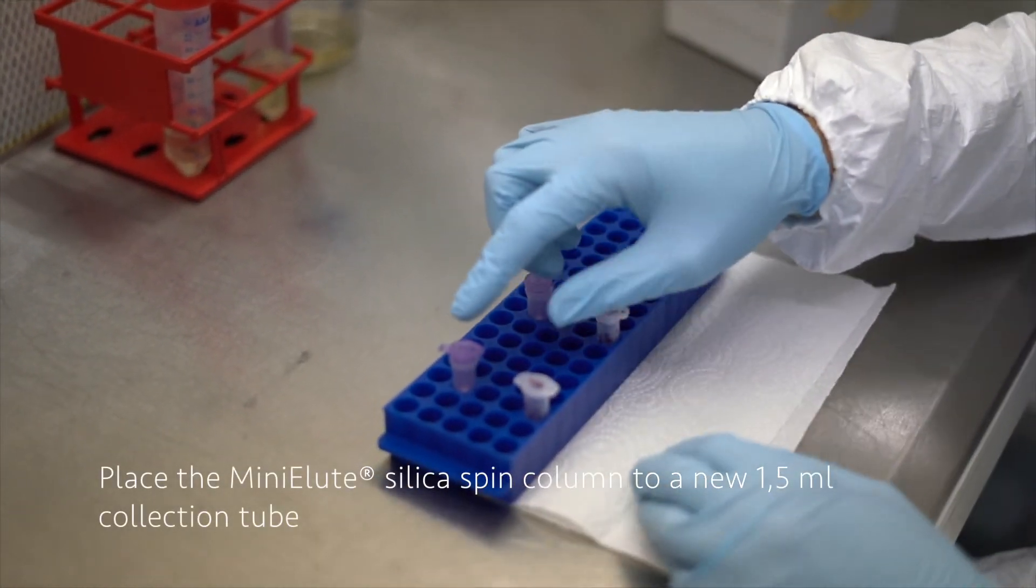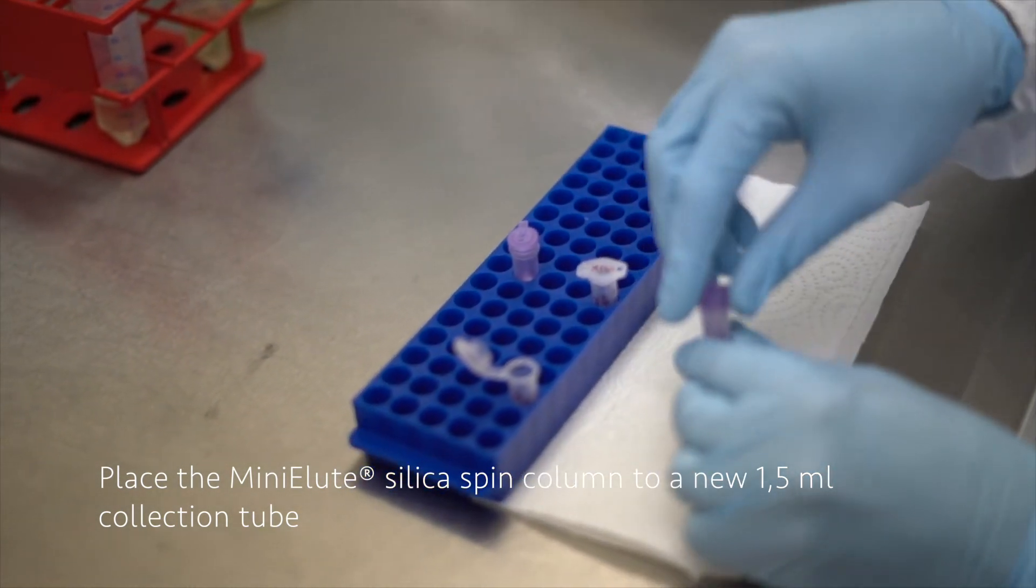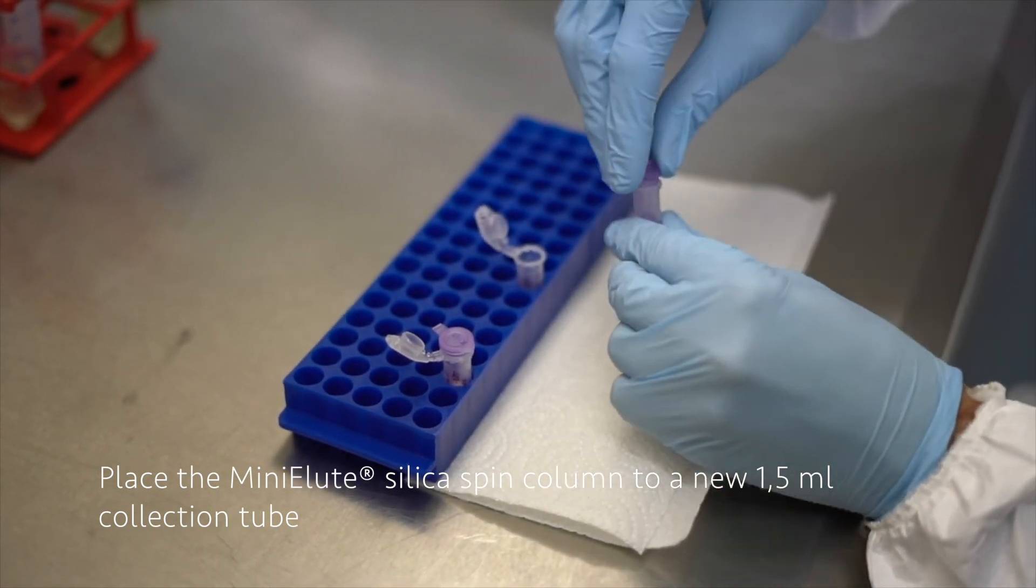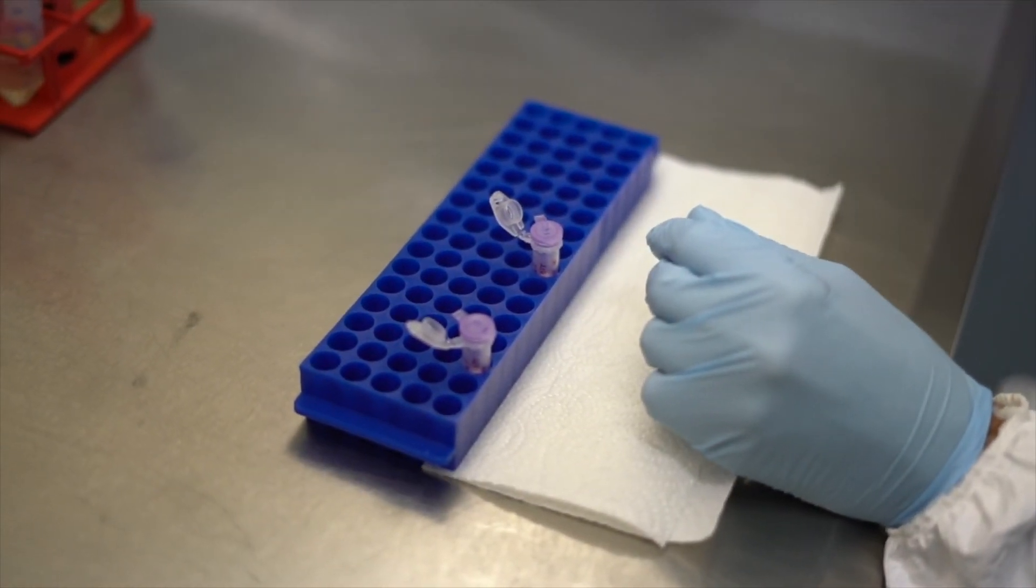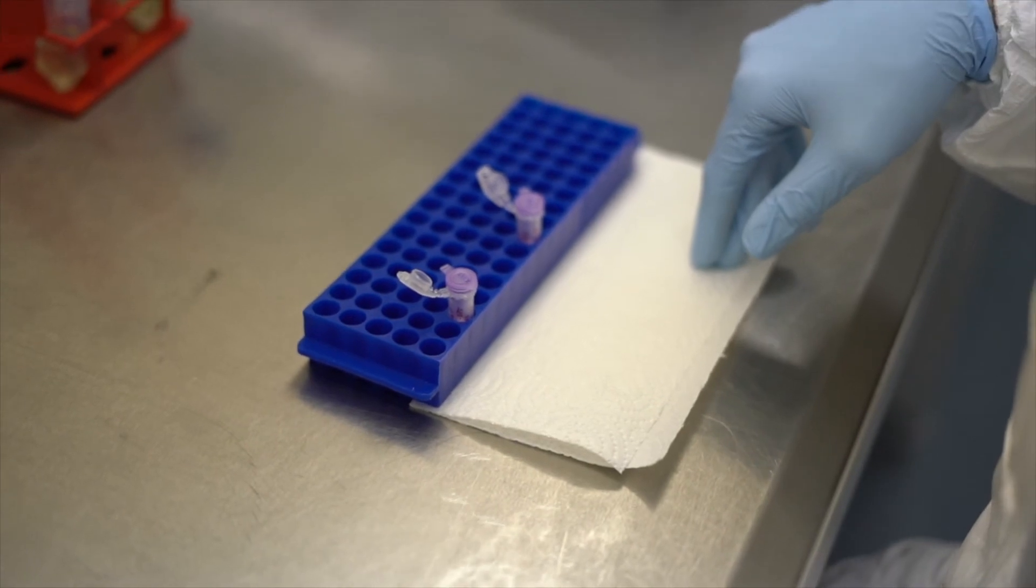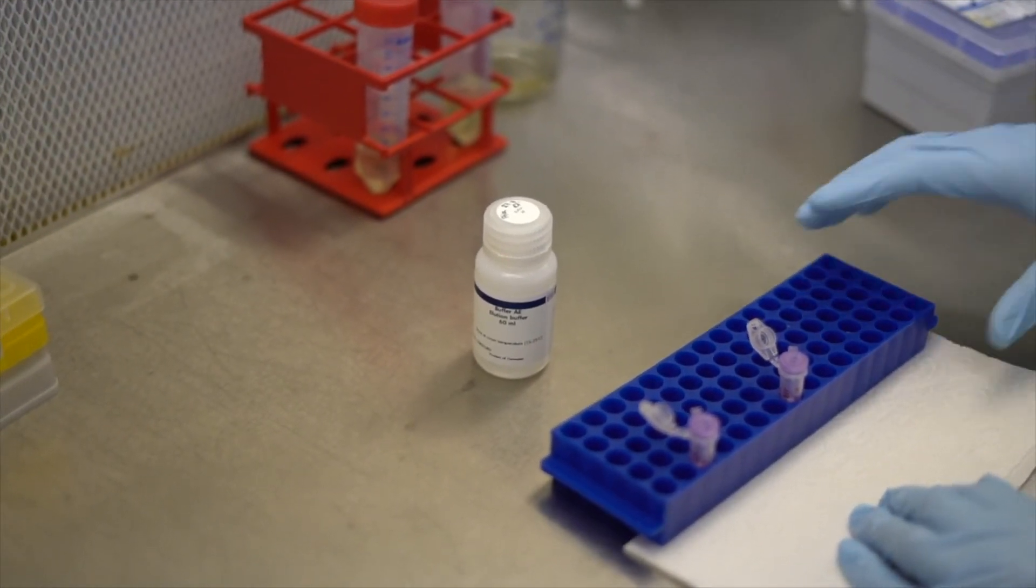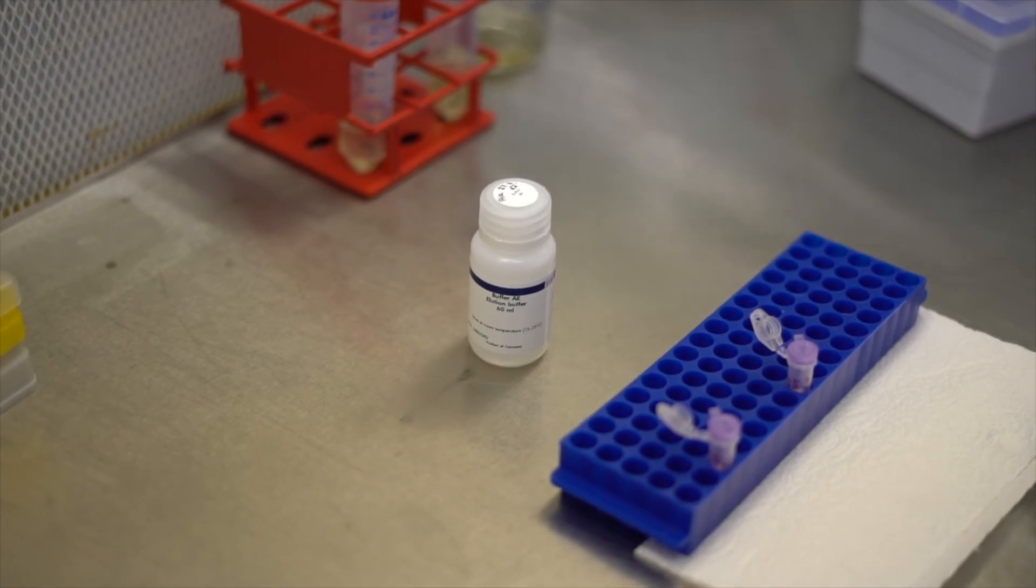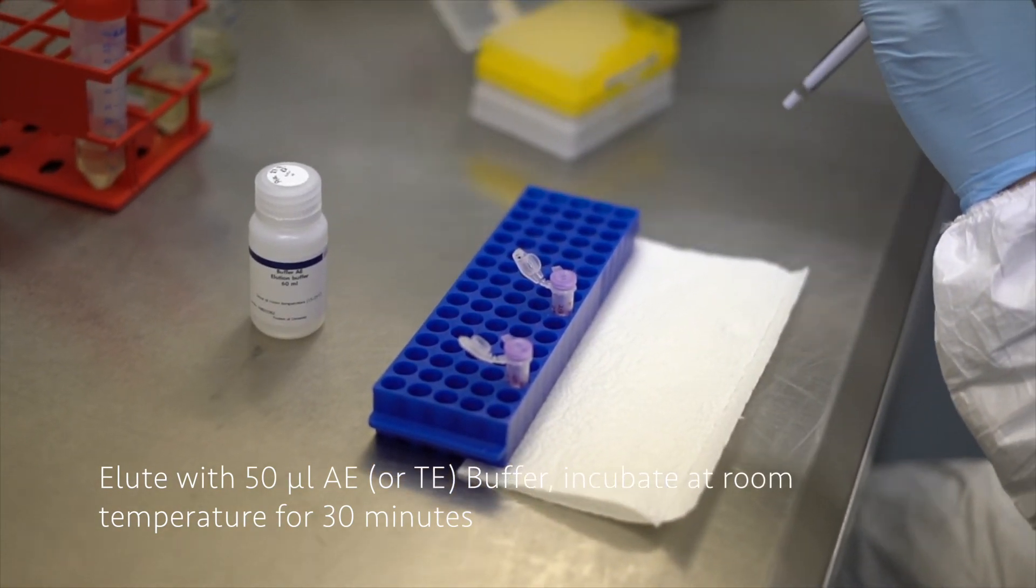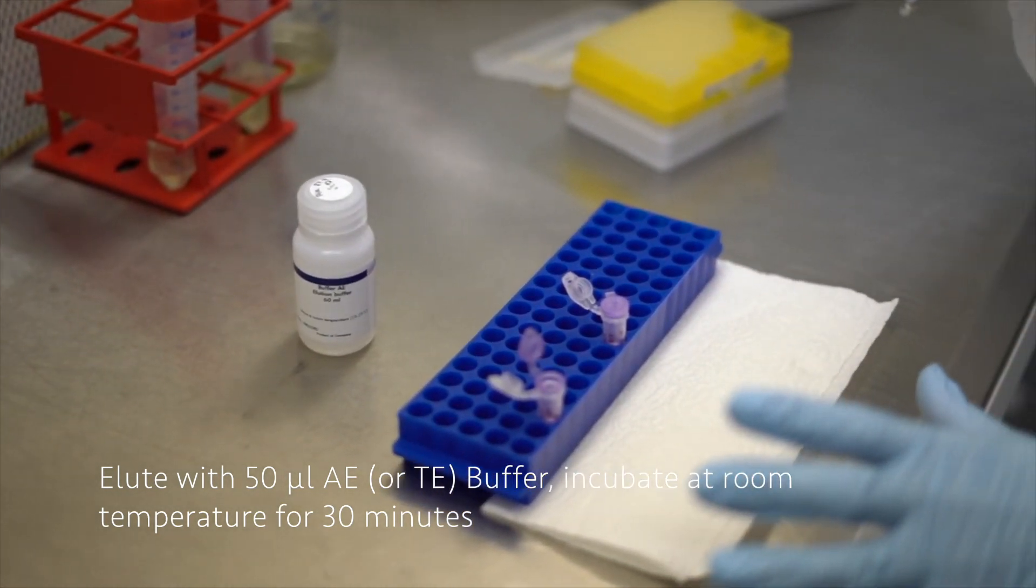Now we can place the MinElute column in a new 2 milliliter or 1.5 milliliter tube. And then we will elute the DNA bound on the silica membrane using, I will use some AE buffer from a Qiagen plant MinElute column, but if you want you can use also the TE buffer. I'm going to add 50 microliters. The elution will be done twice, so 2 times 50 microliters of elution buffer. And I will incubate it for half an hour at room temperature.